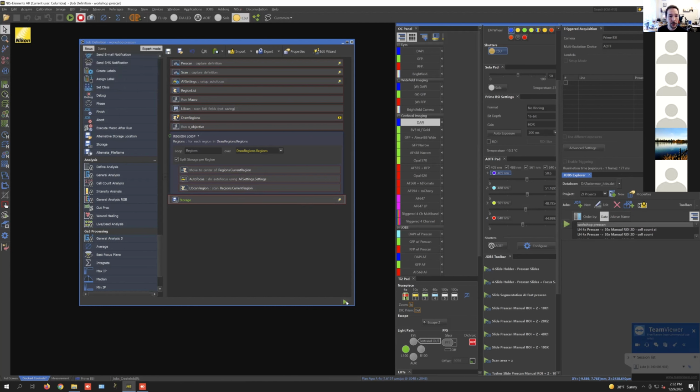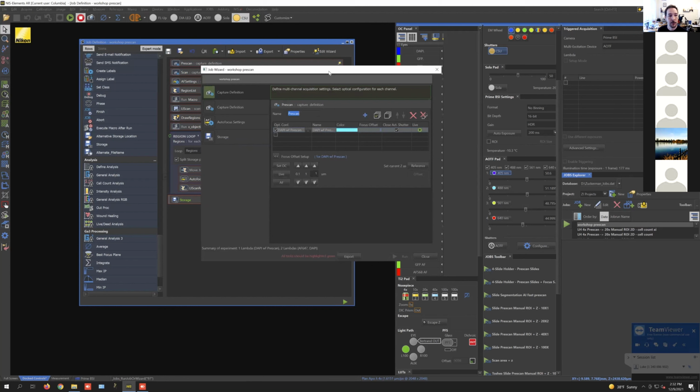When we run this, we'll be presented with a workflow that we can start to answer these questions and get something working. And so if you've used the system already and you've used some of the jobs we've made, this will be very familiar to you. But if you haven't, you always just work from top to bottom on this left-hand side. So each of these tabs you just need to check through, and they'll be marked green after you've looked at them. So we know this is fine. We know that this is fine.